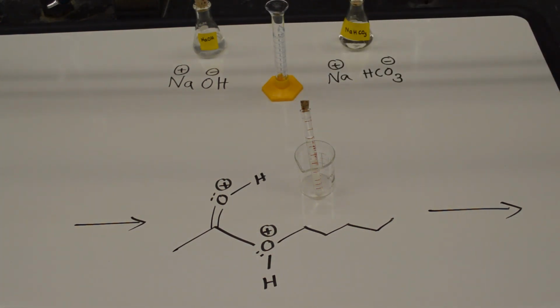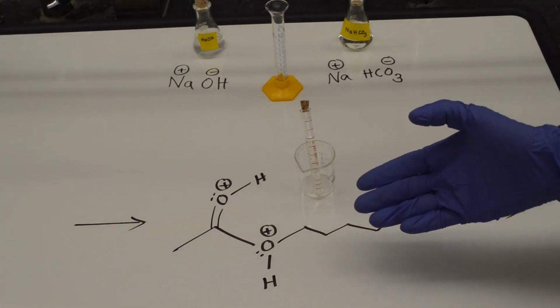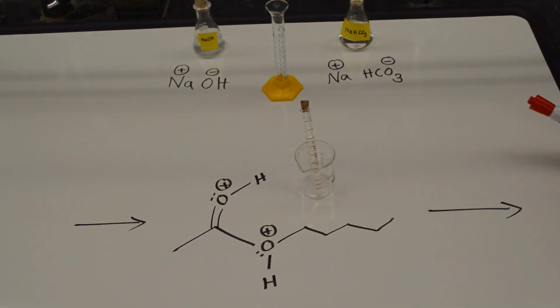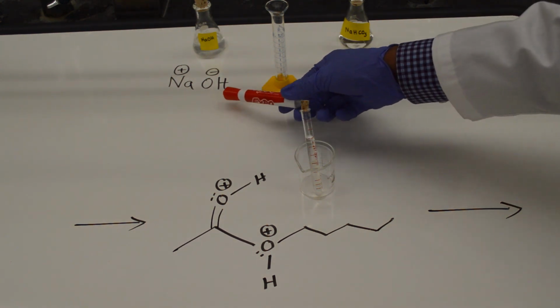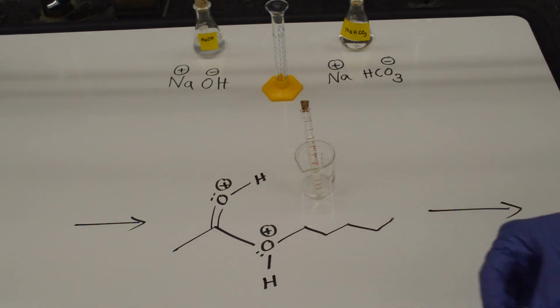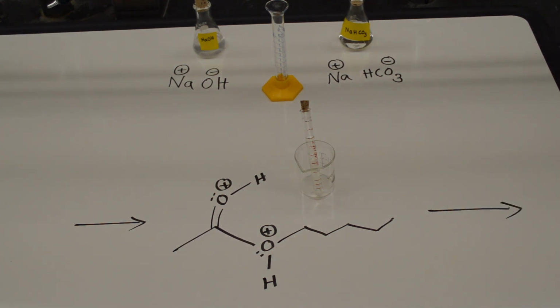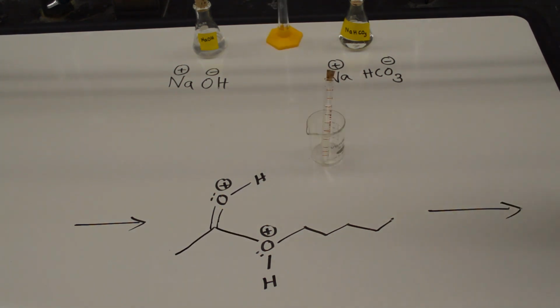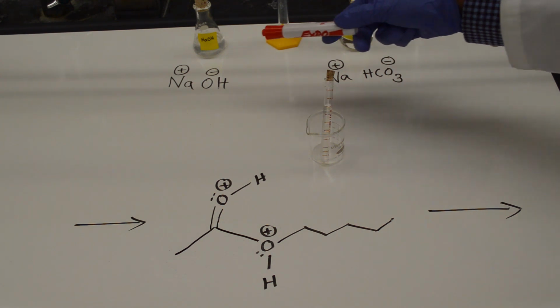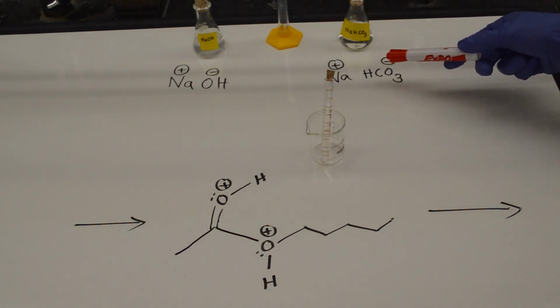Now the question is, how would you neutralize this intermediate into the final product? Which base would you use? Sodium hydroxide or sodium bicarbonate to abstract the protons? You can answer this by assessing the basicity and nucleophilicity of the 2 compounds, sodium hydroxide and sodium bicarbonate.